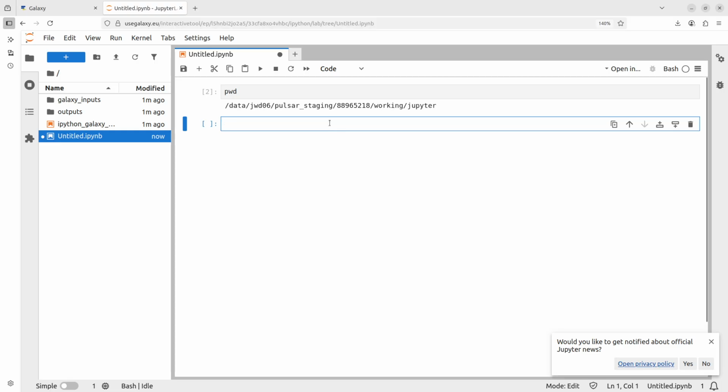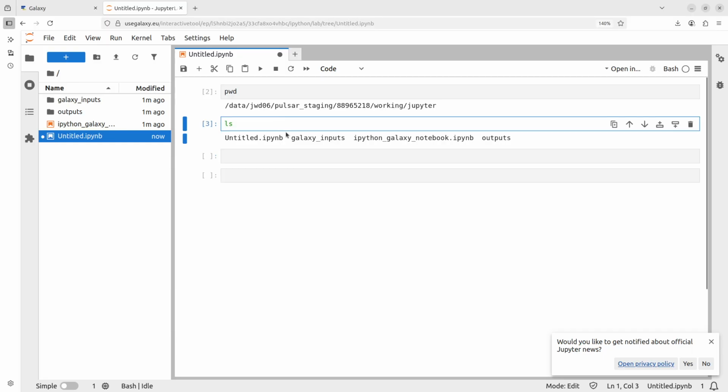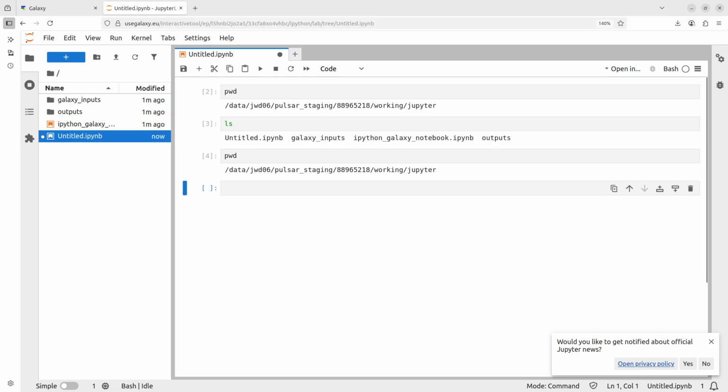Let's do this, ls. I'll type it here. Okay, so ls, and I type the Alt Enter, or you can also use the Shift. I'll just do pwd again. So Shift Enter, like it said, that's the shortcut for running the command. So once you do it, you are going to see your Linux command give you the expected output.